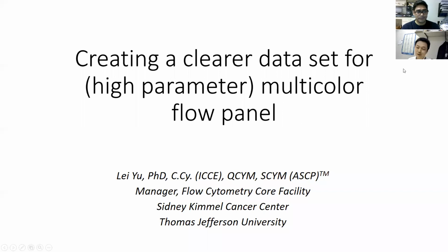So the topic for today is creating a clear data set for the multicolor panel. There are two key points. First of all, we are aiming at a multicolor panel design. And second, we want to pay attention to how we get a clear data set. You can get any data set from flow, but we want to have more beautiful, clear data.